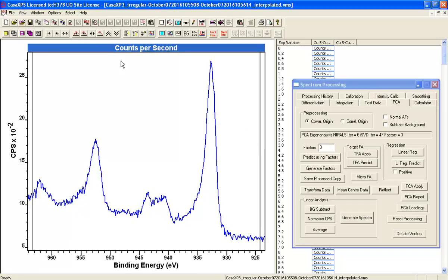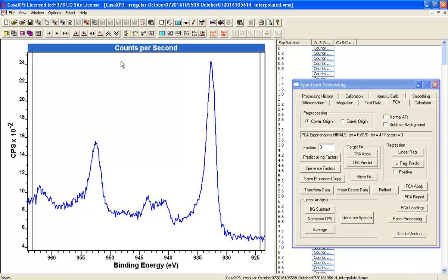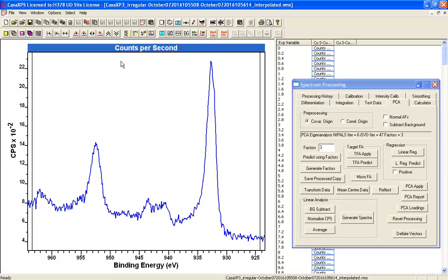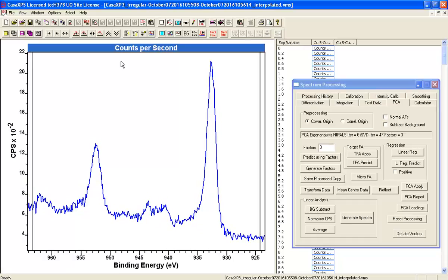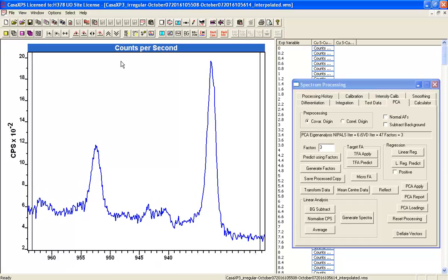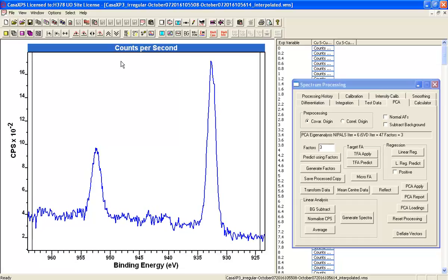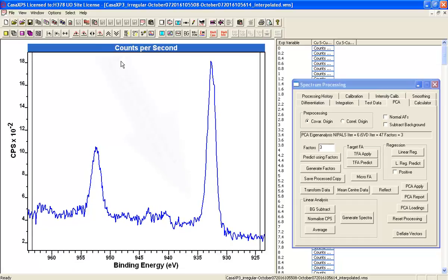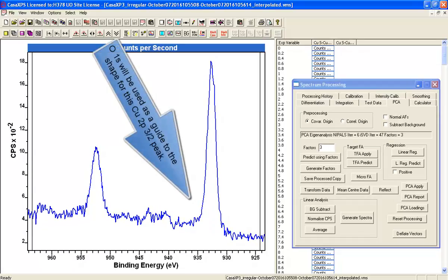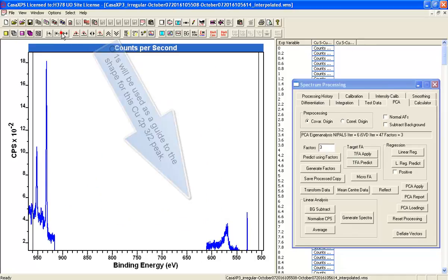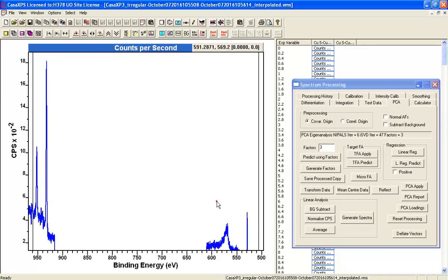And we're going to look at this by considering the Copper 2P. And also, if we select a Copper 2P, how does the Oxygen 1S and the Auger look? And this gives us an idea of whether we are choosing wisely the types of peaks from the Copper 2P.